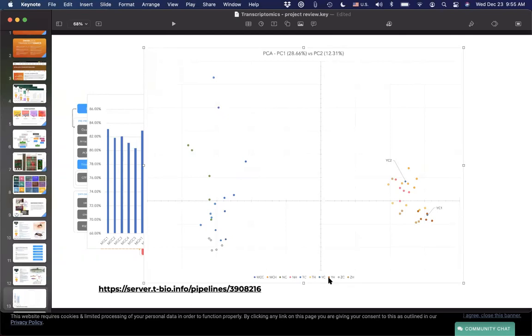What I had mentioned to you, I just want to point it out since it shows up here. If you look over on the left at the controls, at the very bottom, those open circles are the inbred ones, and that's what I had seen before, that they all cluster on that dimension at one extreme end.